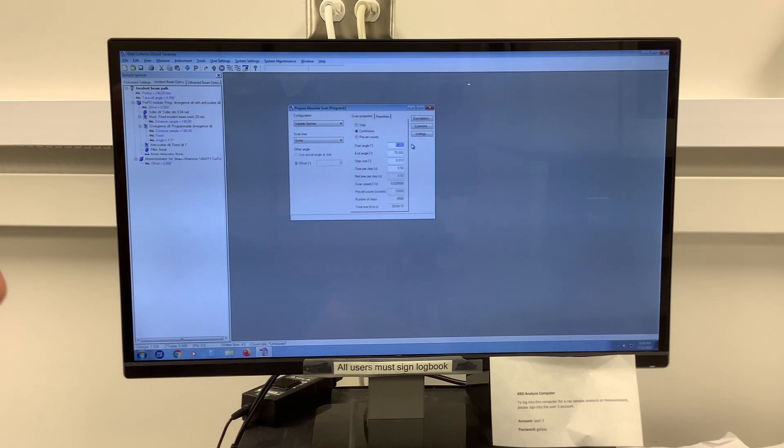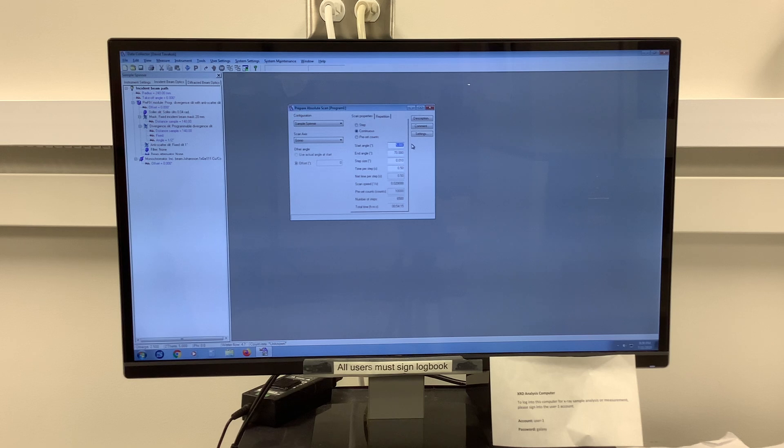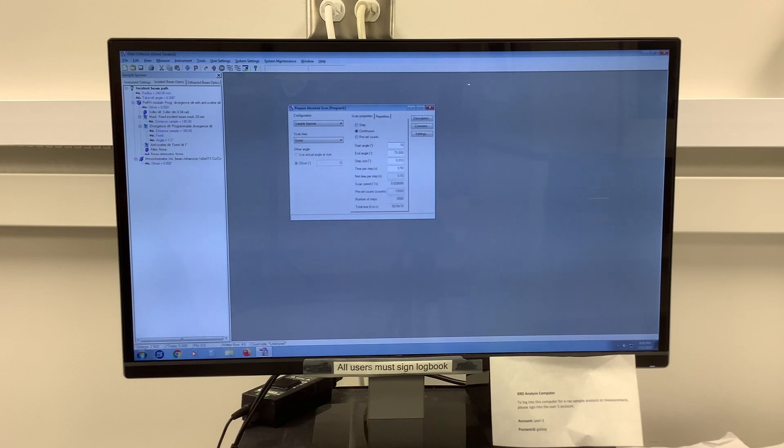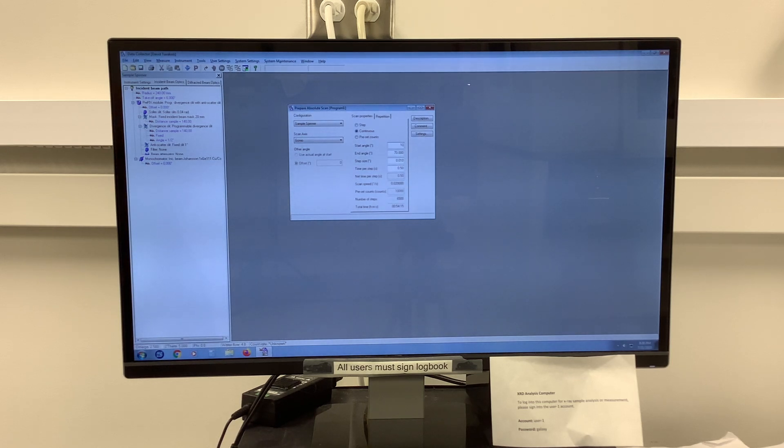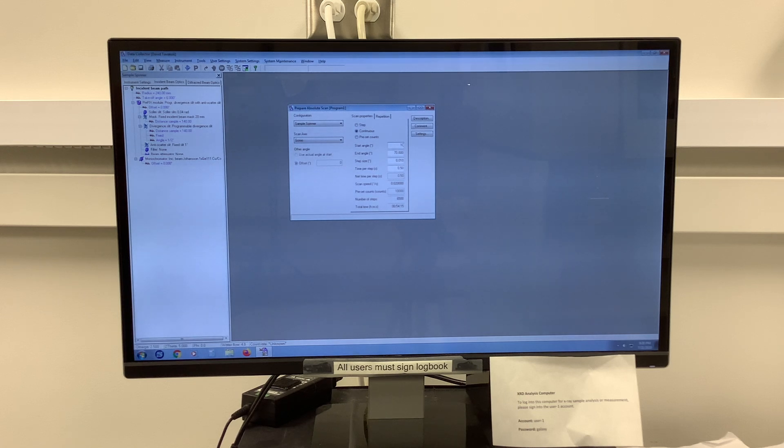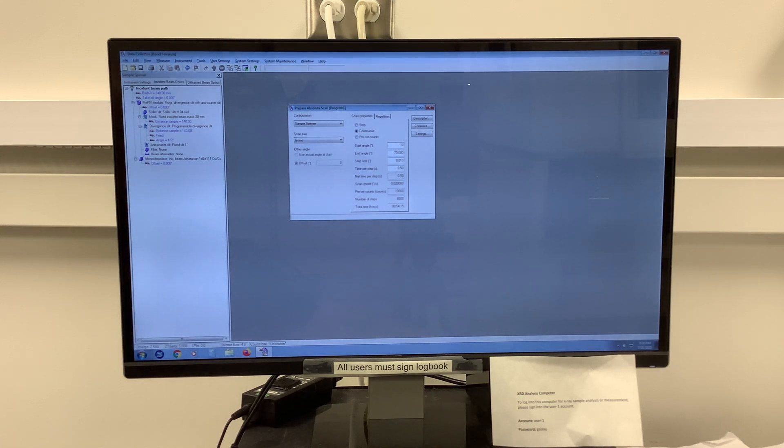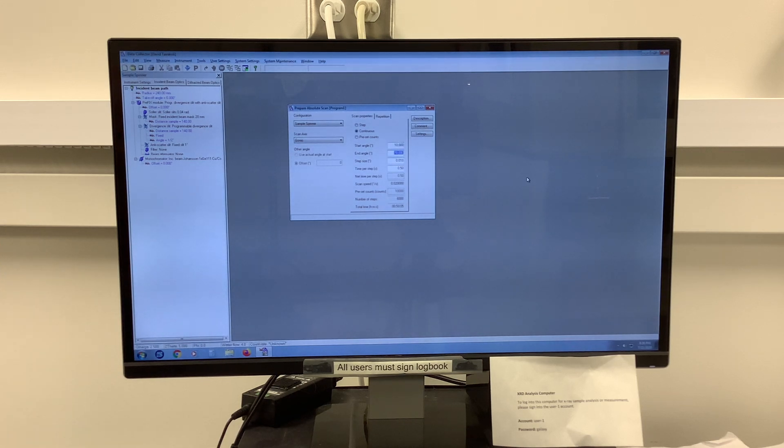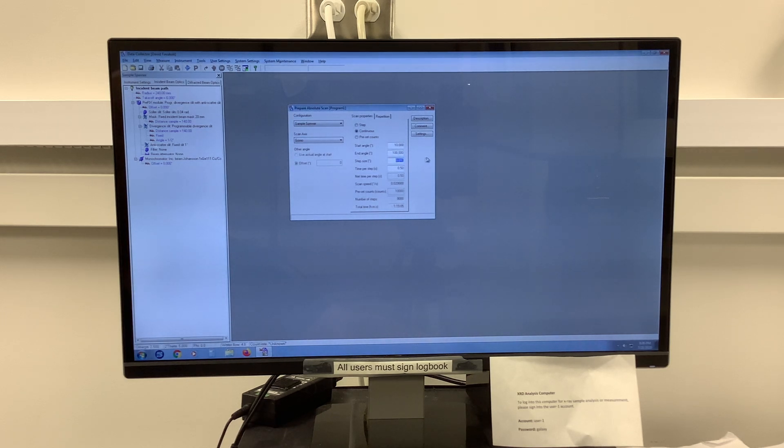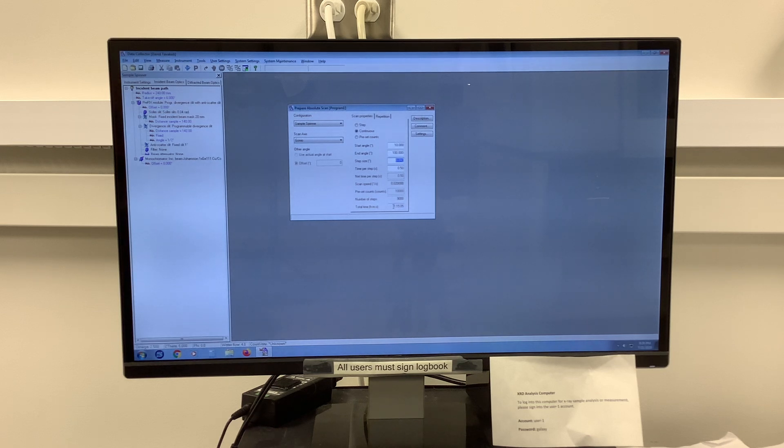The first parameter is what is the start angle and what is the end angle of your particular measurement. In our case, we'll be starting at 10 degrees. If you're not sure what starting angle you should be using, we'll be discussing this in another section about how to use the PDF database by ICDD, or we can discuss that using some other databases that are online as well. My end angle in this case will be 100 degrees. If I press tab or any other cell within this window, it will update the total time. Now I'm looking at an hour and 15 minutes.